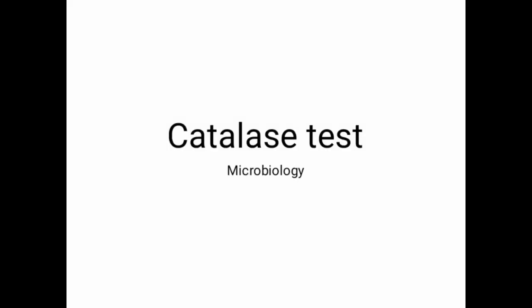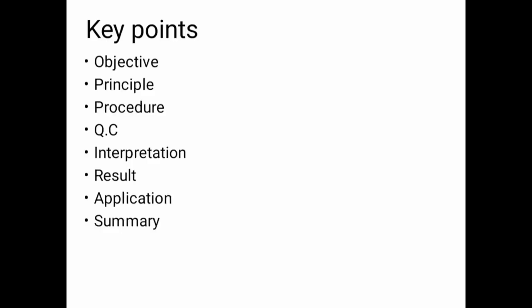Yes, this is microbiology. Today I'm here to present the most important topic, that is the catalase test, and it is a biochemical test. So this is the main key point of our topic. We discuss the objective of this catalase test, the principle, the procedure, and we discuss the QC. Then the most important interpretation and result, and then we discuss the application and summary of the catalase test.